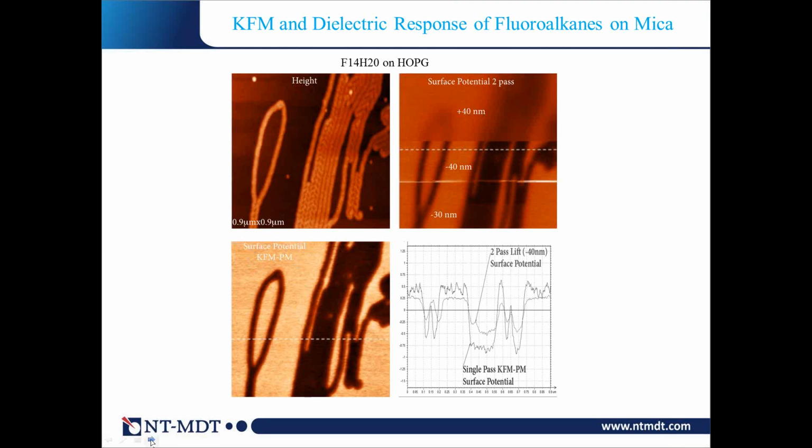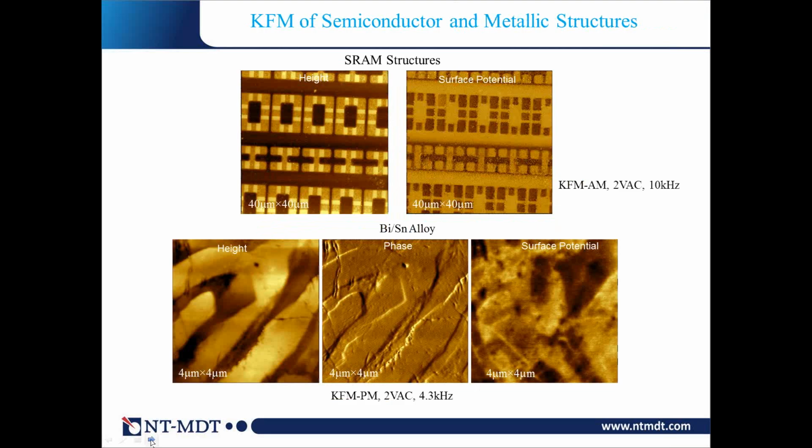But again, here we come to optimization, because there are different types of challenges if you do multi-frequency measurements, because you usually have several different detection schemes to measure the same property. The problem is, for a particular material, you don't know what will work best, because that's an open question.